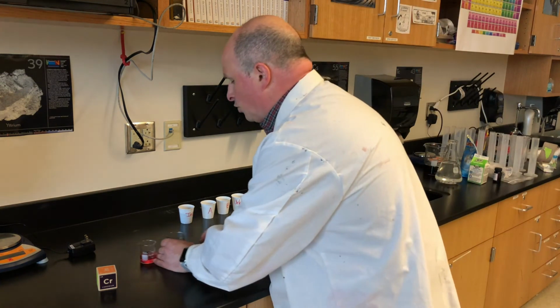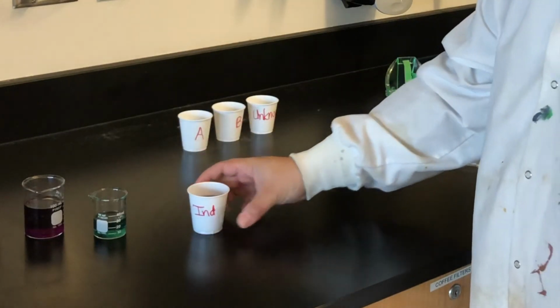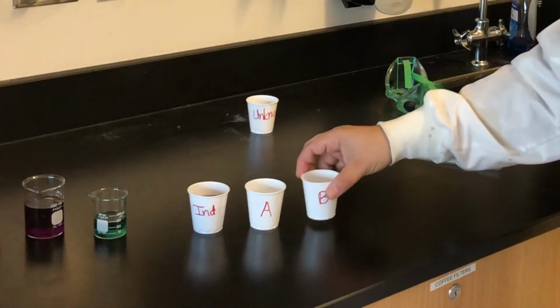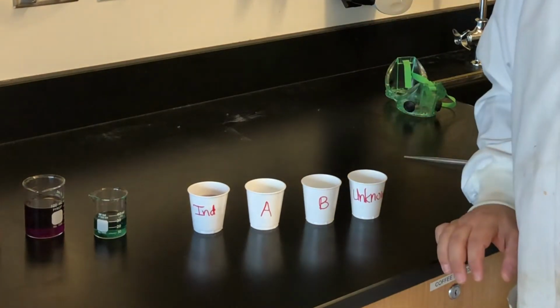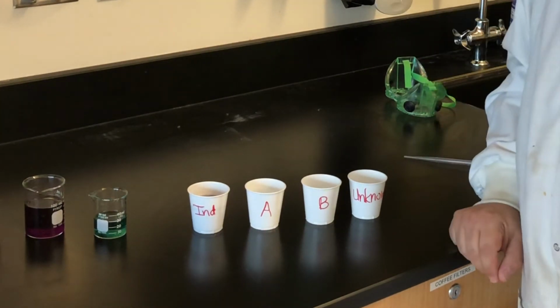So that brings us to our lab. In the lab, you're going to be given a cup of indicator, which is that purple color because it's neutral, and you're going to be given a clear liquid that is an acid, and a clear liquid that is a base, and a clear liquid that is an unknown. Now, each team will get a different unknown, so you won't know what the unknown is. That's why we call it the unknown.